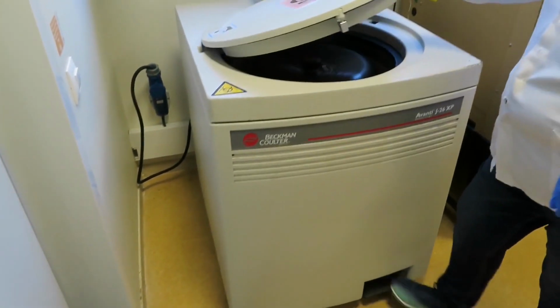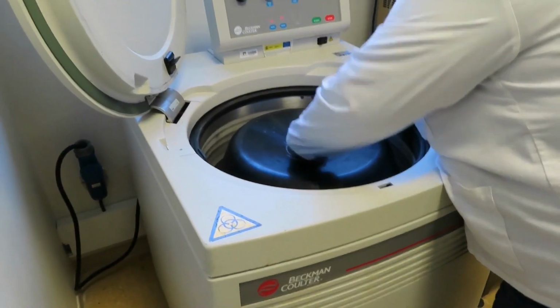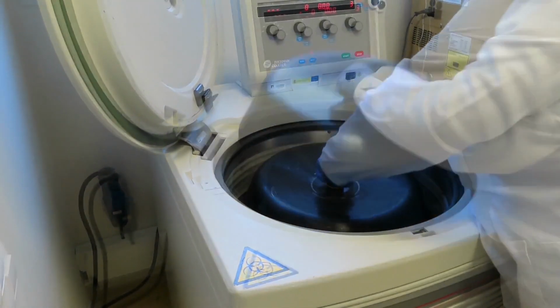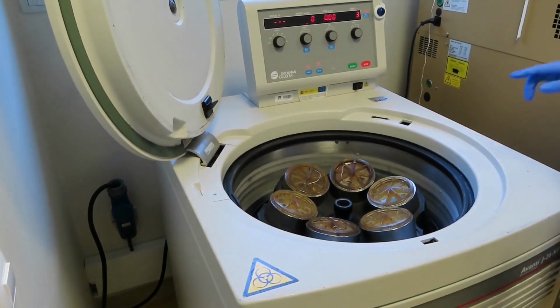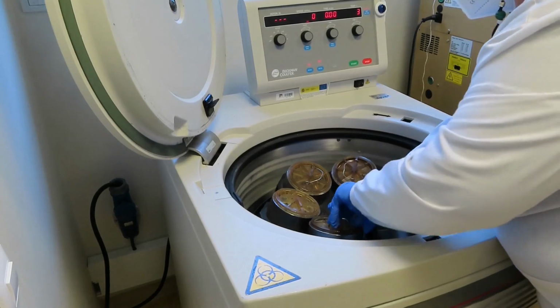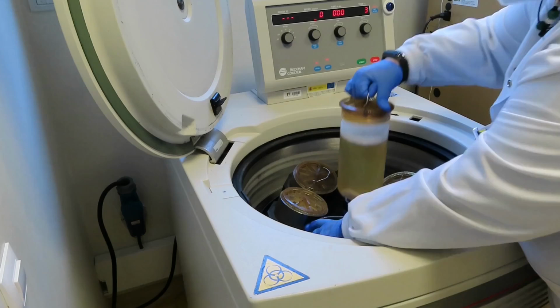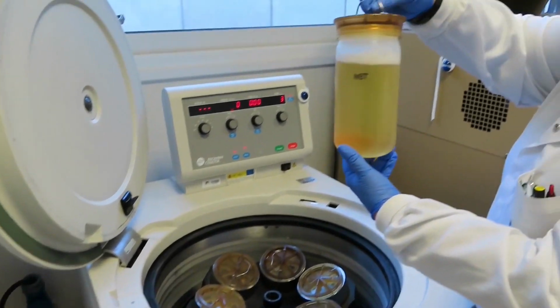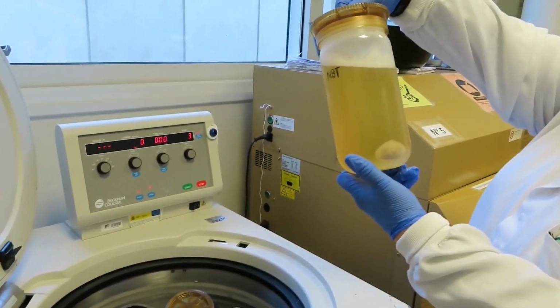Once the incubation period is over, the culture is centrifuged 15 minutes at 5000 g. For secreted proteins, the supernatant is kept, and the purification is carried out immediately from the extracellular medium. In the case of proteins contained inside the cells, the pellet is frozen at -80 Celsius degrees until the purification. Now we move to the next section, protein purification.